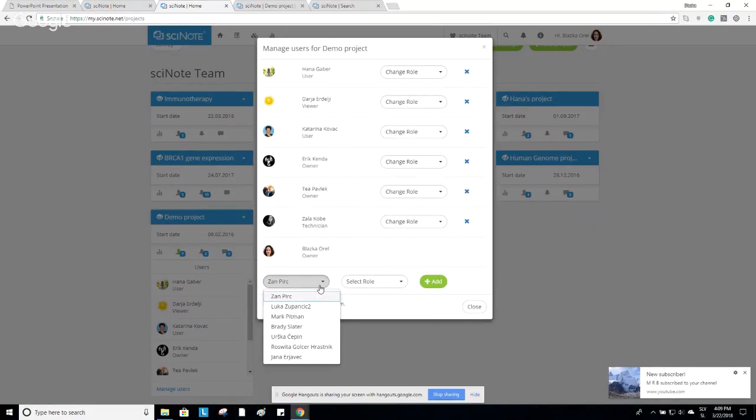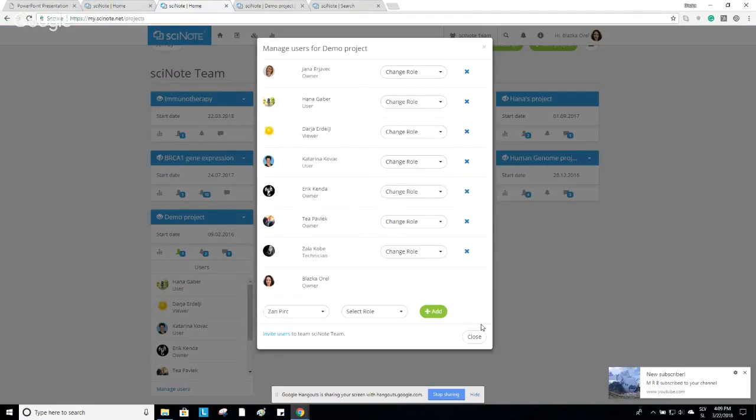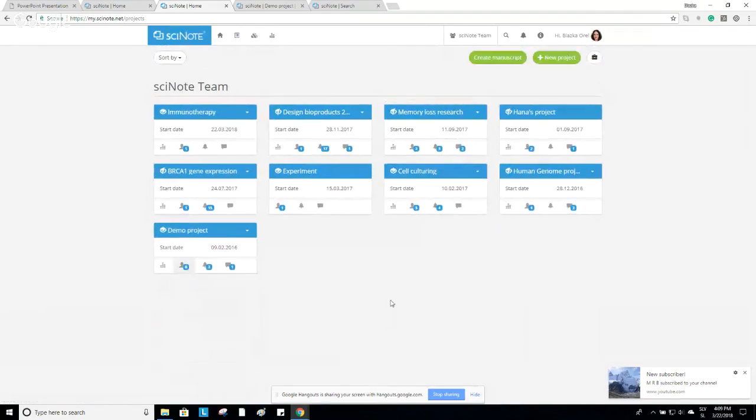So for example, if I decide to invite Yana, who is a normal user at the team level, and she wants to become also a leader of this demo project, over here I can assign her the owner user role. This is one of our project roles that you can assign to people. The next ones are the user, the technician, and the viewer. Okay, so we have done this. These roles basically determine what your permissions are on a particular project.